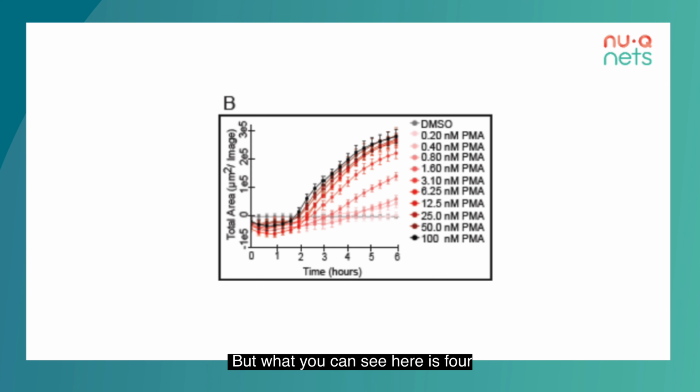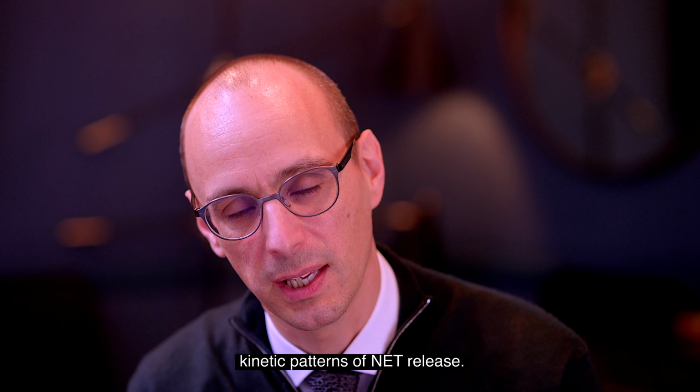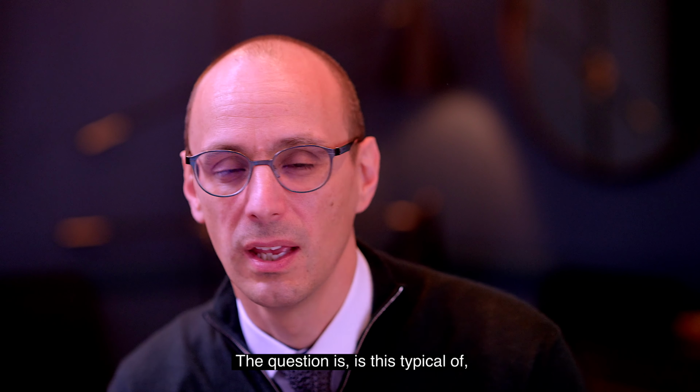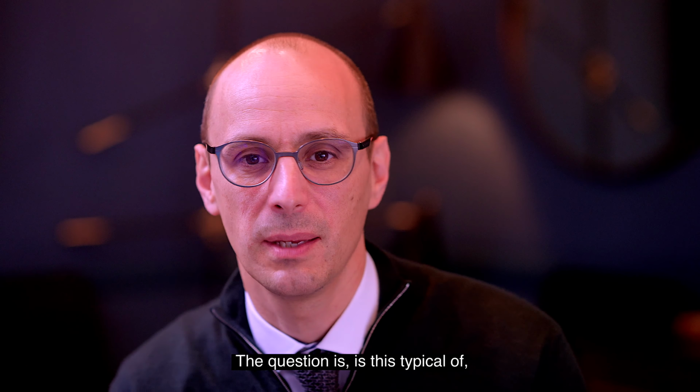But what you can see here is 4 different lines, 4 different patterns of NET release. We don't know the answer yet, but it's an area we're really focusing on with the Innovation Lab. So we're seeing 4 different kinetic patterns of NET release. The question is, is this typical of, or indicative of, those different types of NET release that I've mentioned to you before: suicidal, vital, or mitochondrial? Or is it actually just due to a different type or different way of stimulating the cell?